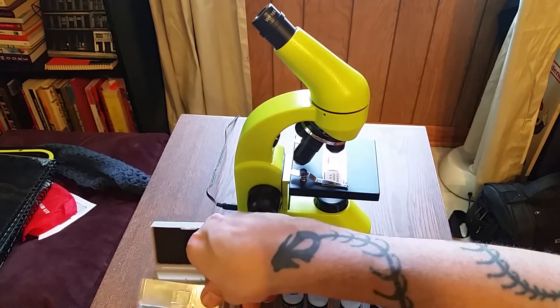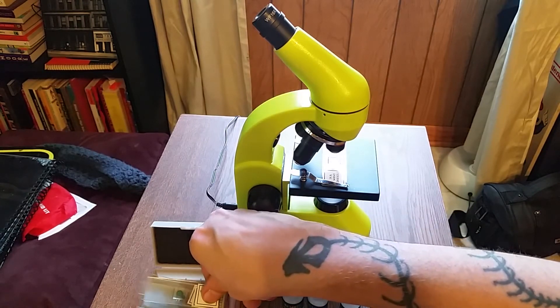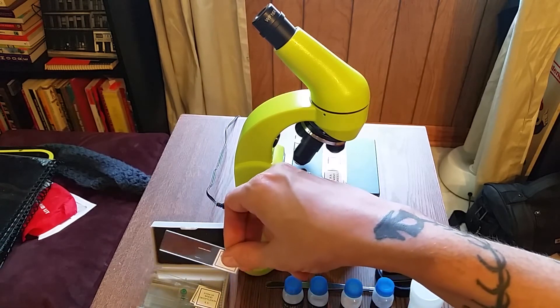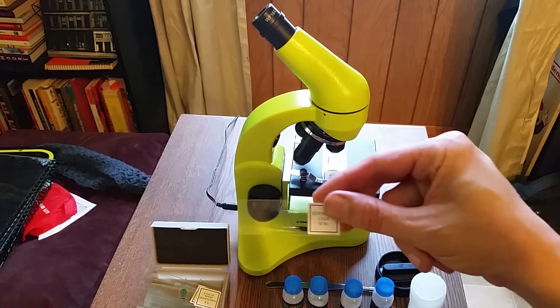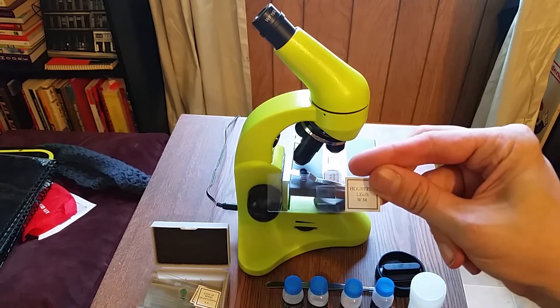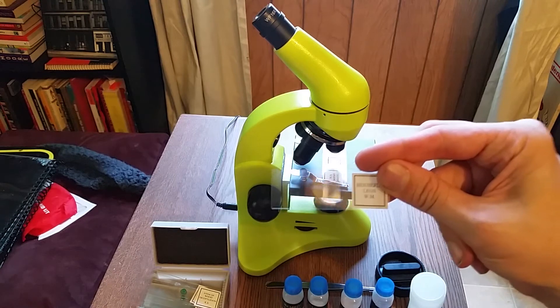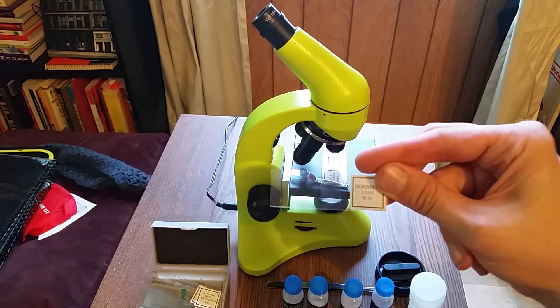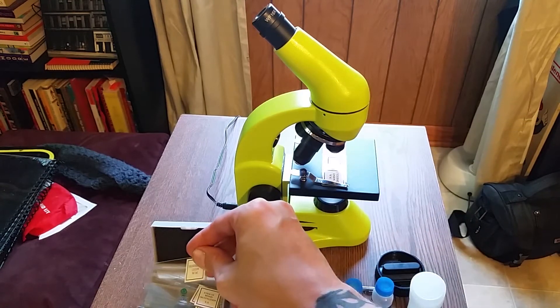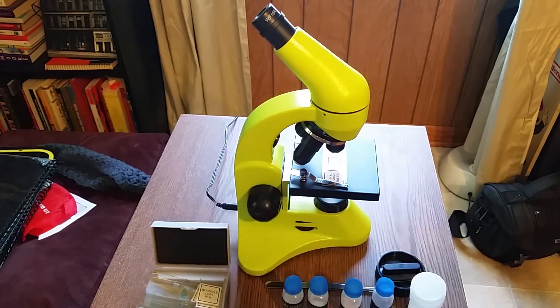Out of the slides that come with this, you have onion, cotton stem, different slices — I think of a tree trunk, a pine — but my favorite was the housefly leg. If you want to show a kid what something looks like under a microscope, the housefly leg is actually really interesting. We had been watching different movies — we've been watching The Thing — so I thought that was an interesting inclusion.